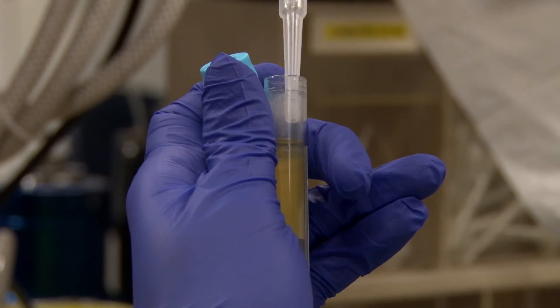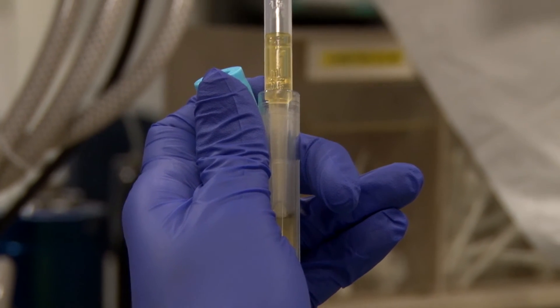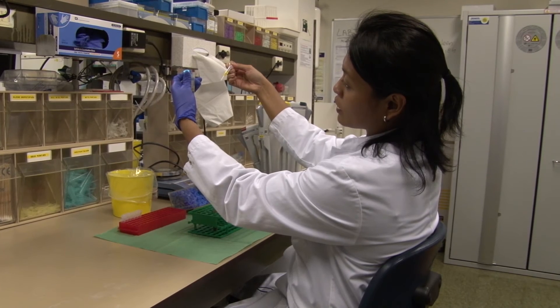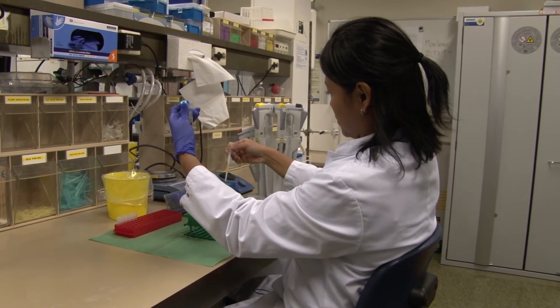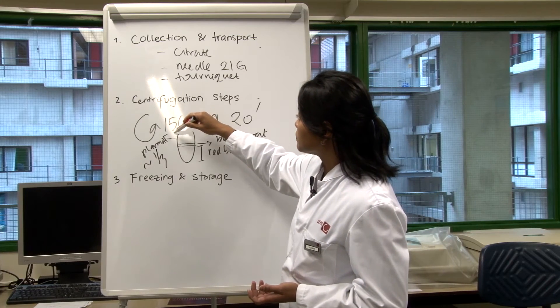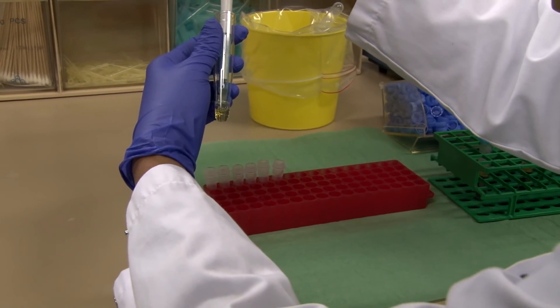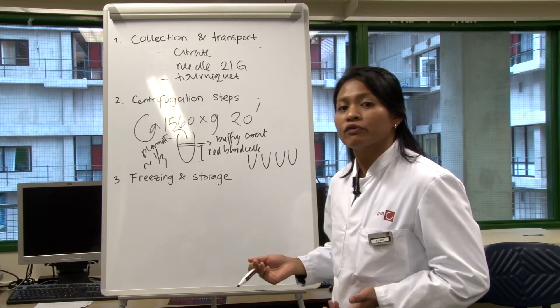Carefully insert the pipette into the plasma and take out the plasma, leaving about 700 microliters of plasma on top of the blood. Then carefully pipette out this plasma and put it in aliquots of about 250 microliters.